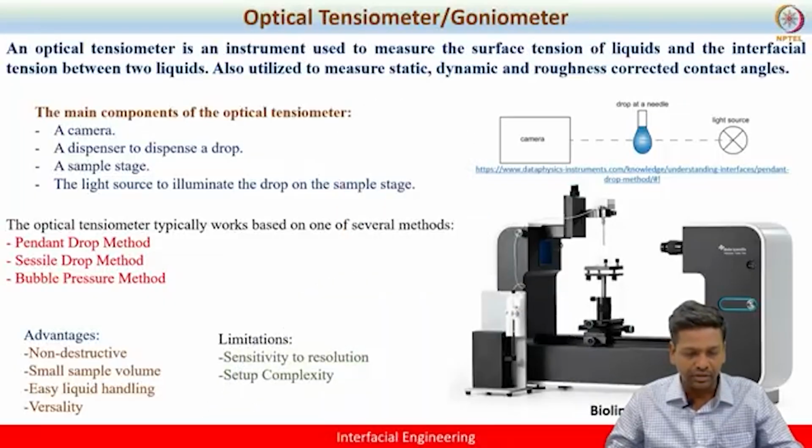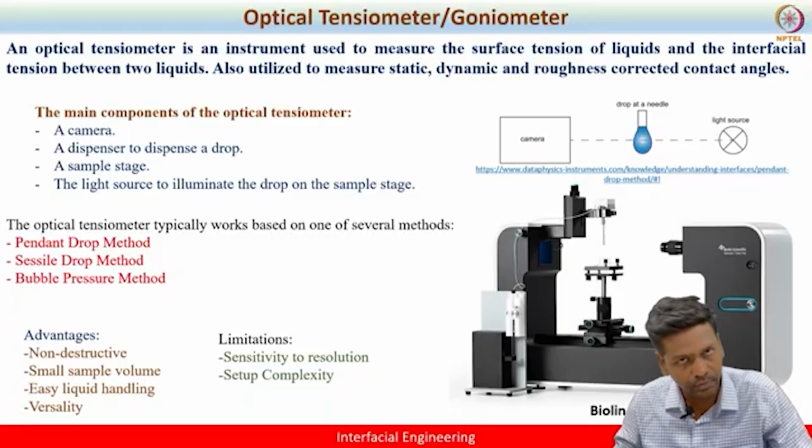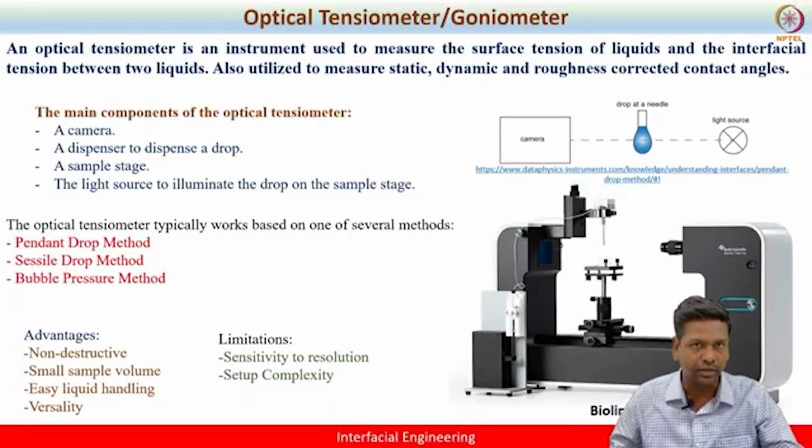As just described, optical tensiometer can also be used in place of force tensiometer to determine the surface tension.